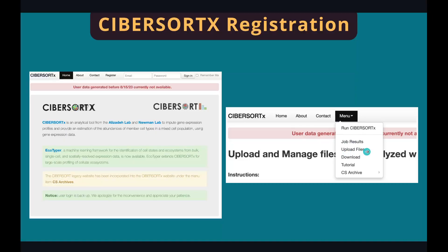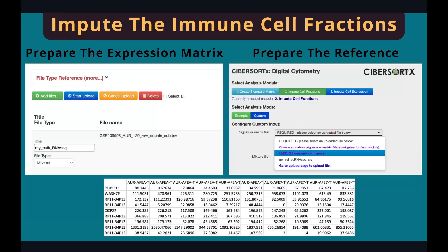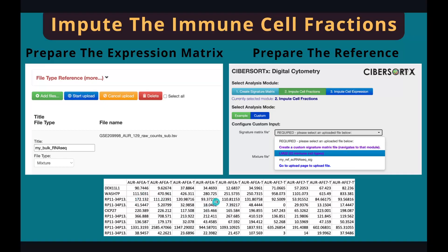Now let's click on Upload Files to go to the next page. As in all our other tutorials, our first step is to prepare the data. In this case, there is actually not much to prepare — we only need a raw count table. The first column is a gene symbol and all other columns are samples, and the numbers are the counts. Once you have it, upload it to the web page. Make sure you give it a proper name and select the correct file type — it's a mixture. This is very important; if you select the wrong one, you won't be able to run the analysis.